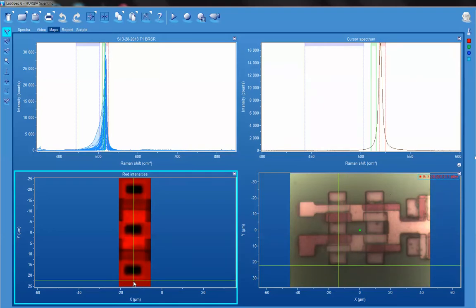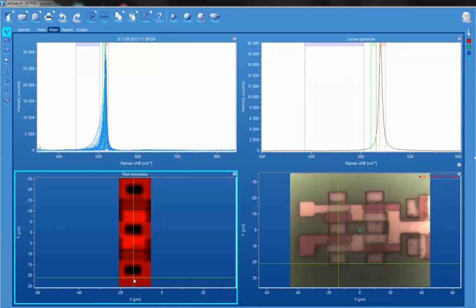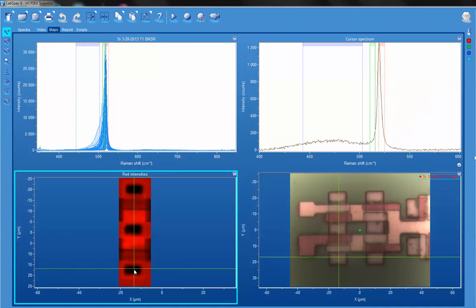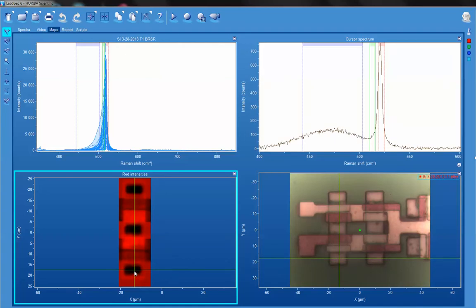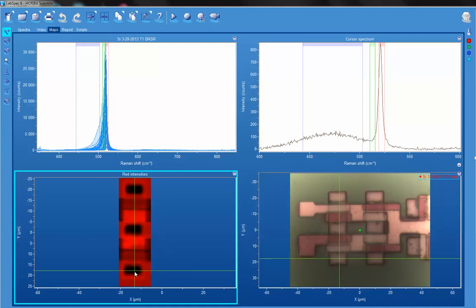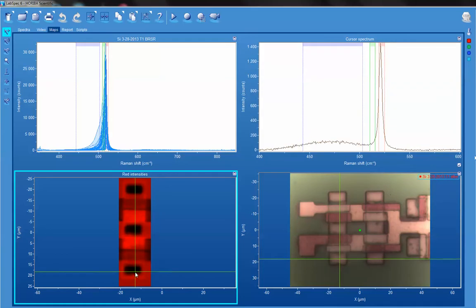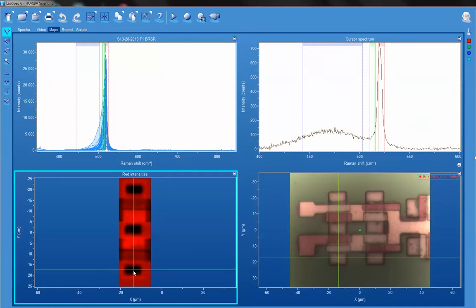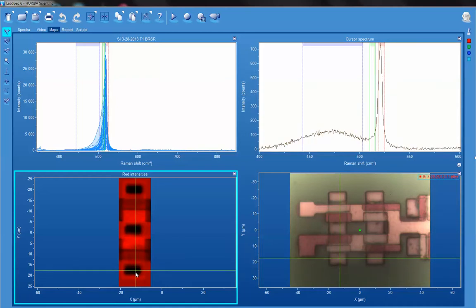Now we move over onto an oxide. This dark area is an implant where arsenic has been ion implanted into the silicon as a dopant. As a result, the intensity of the first order phonon mode from the Brillouin zone center is significantly reduced. You also see Raman scattering from the amorphized portion of the silicon. When an implant occurs, it disrupts the long-range translational symmetry, resulting in a major decrease in Raman scattering strength.